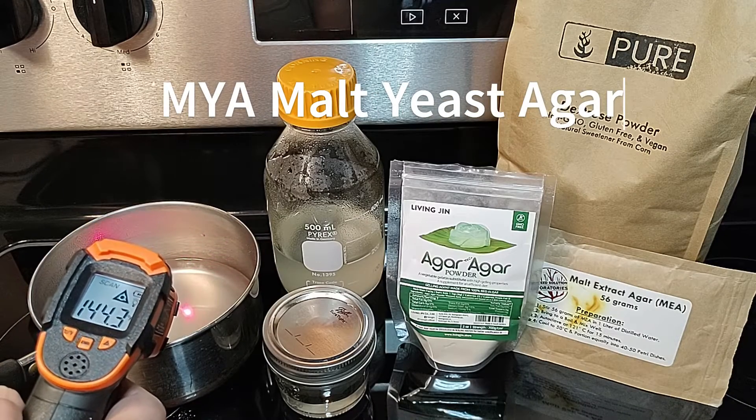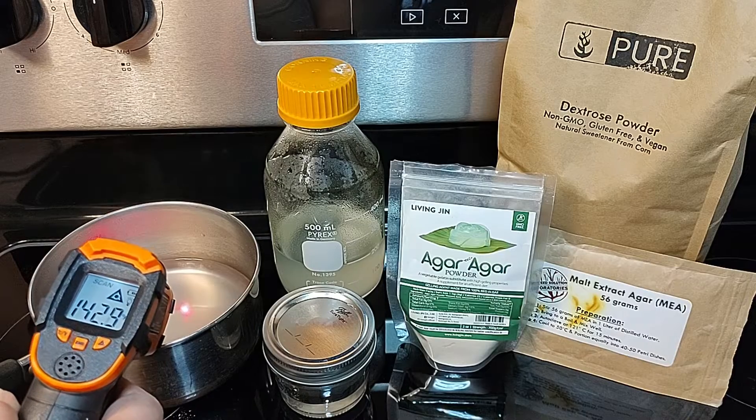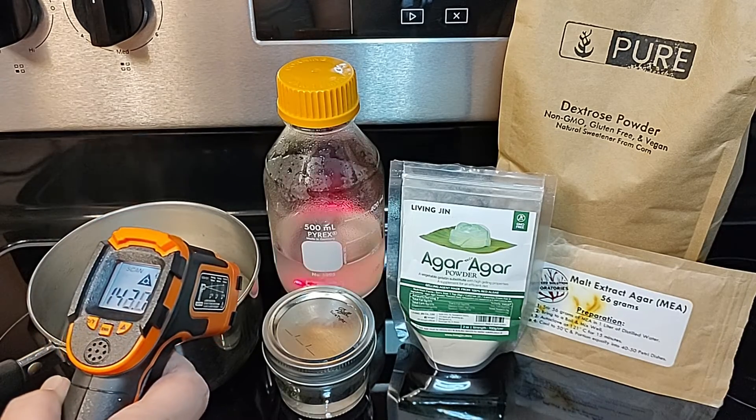When trying to research different types of agar recipes, we found it difficult to locate which types there are and what actual recipes work to benefit mycelium growth.